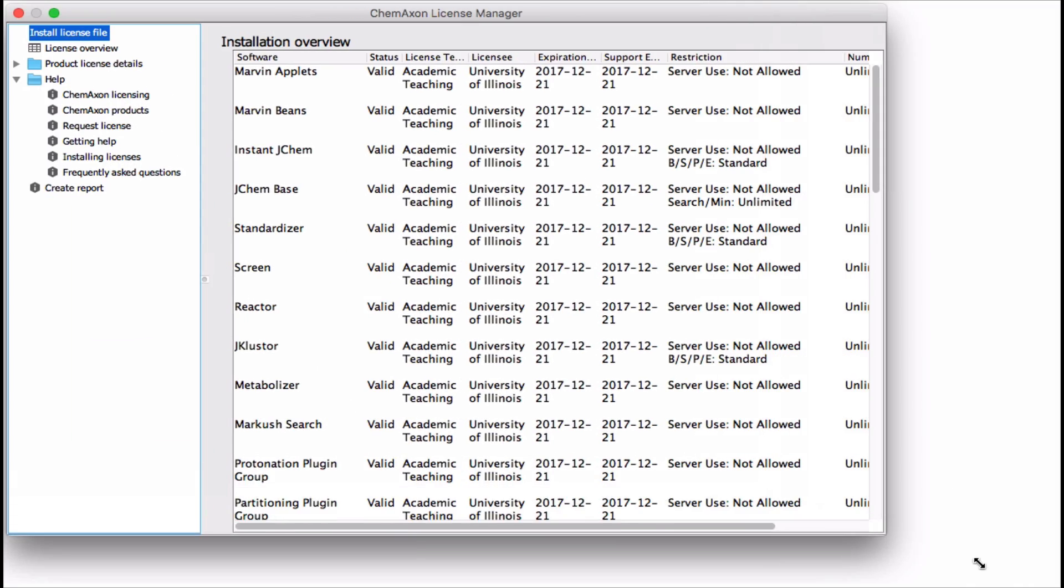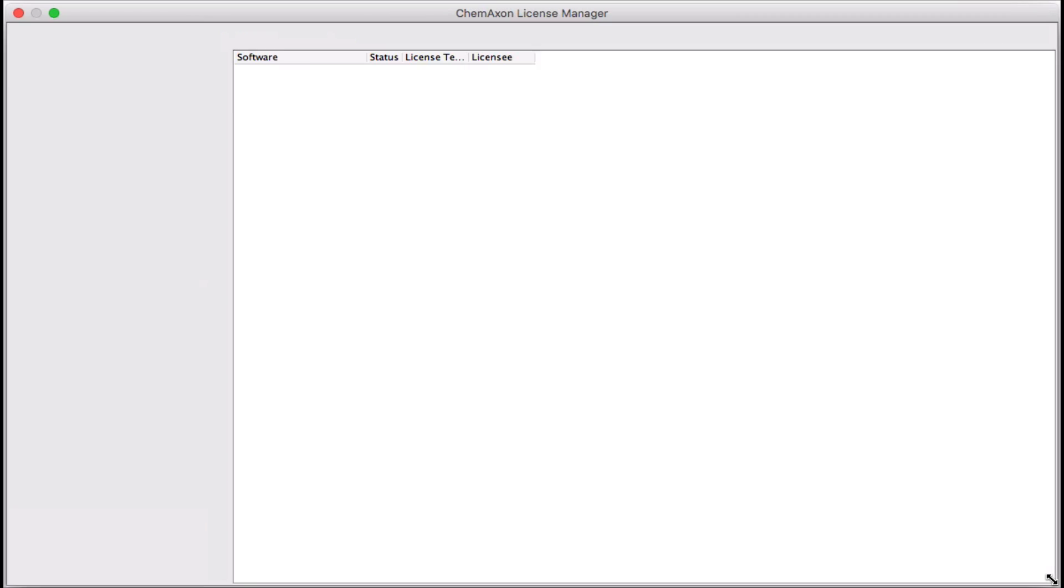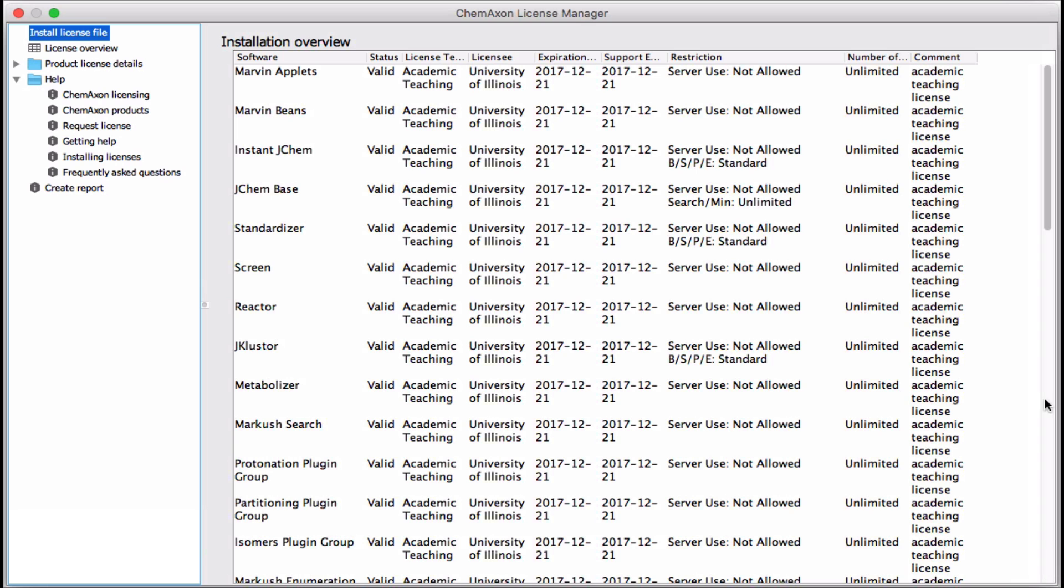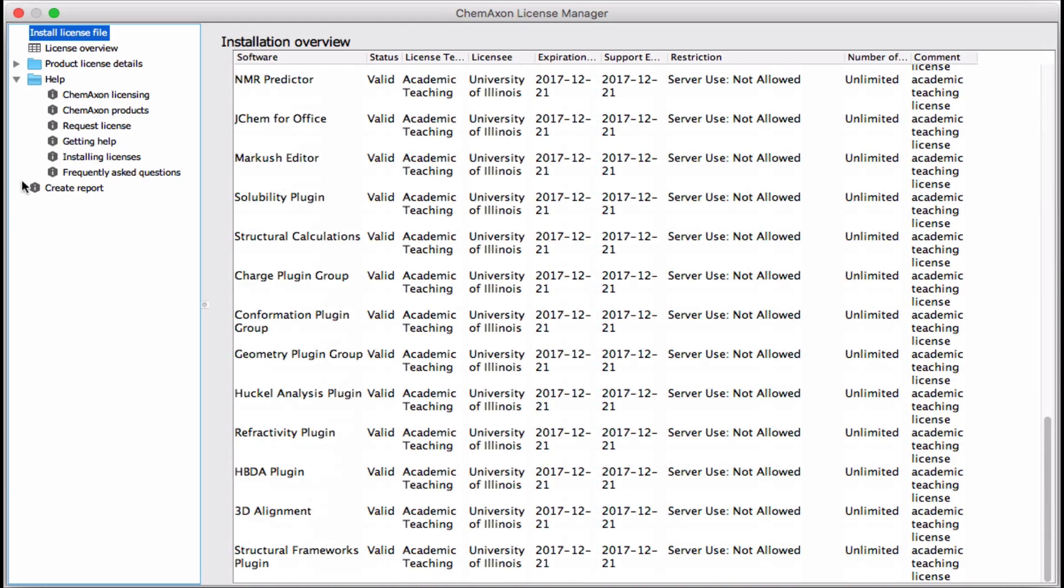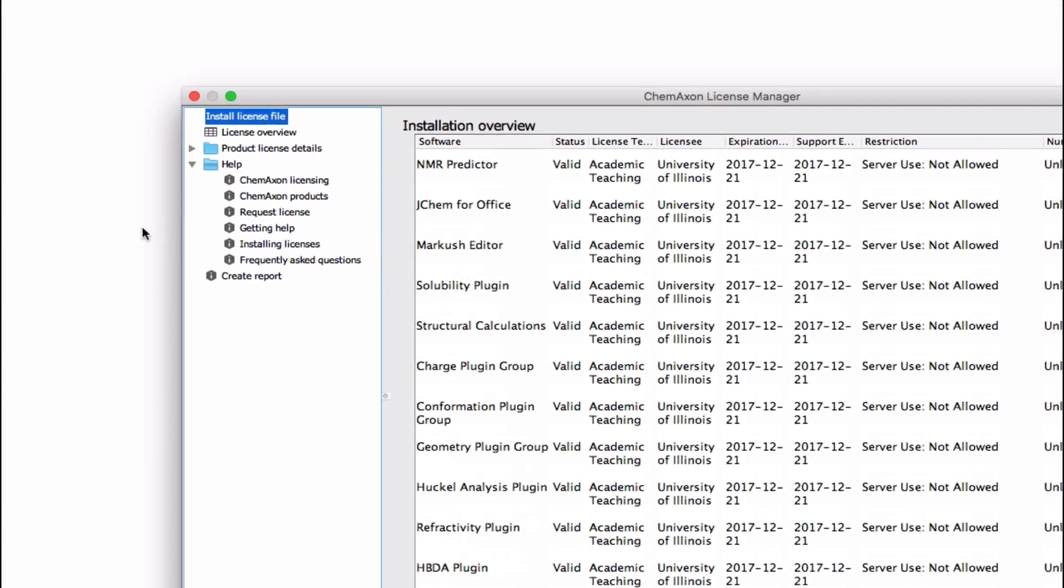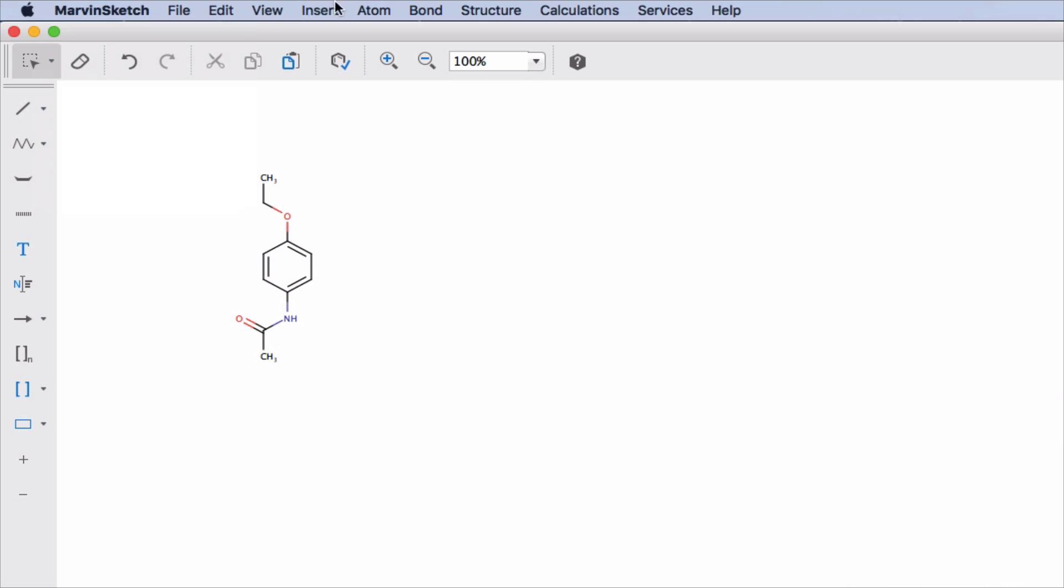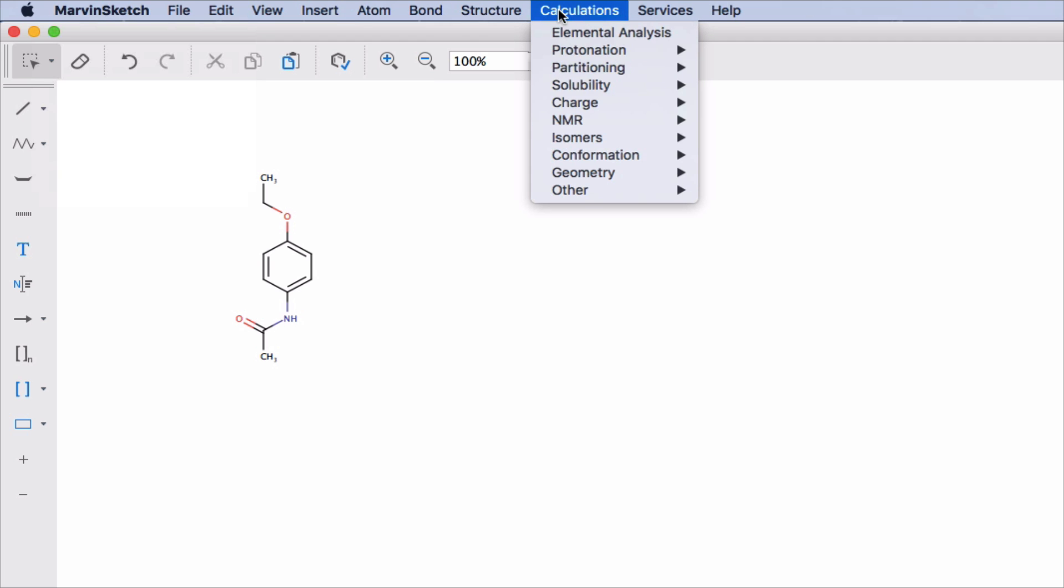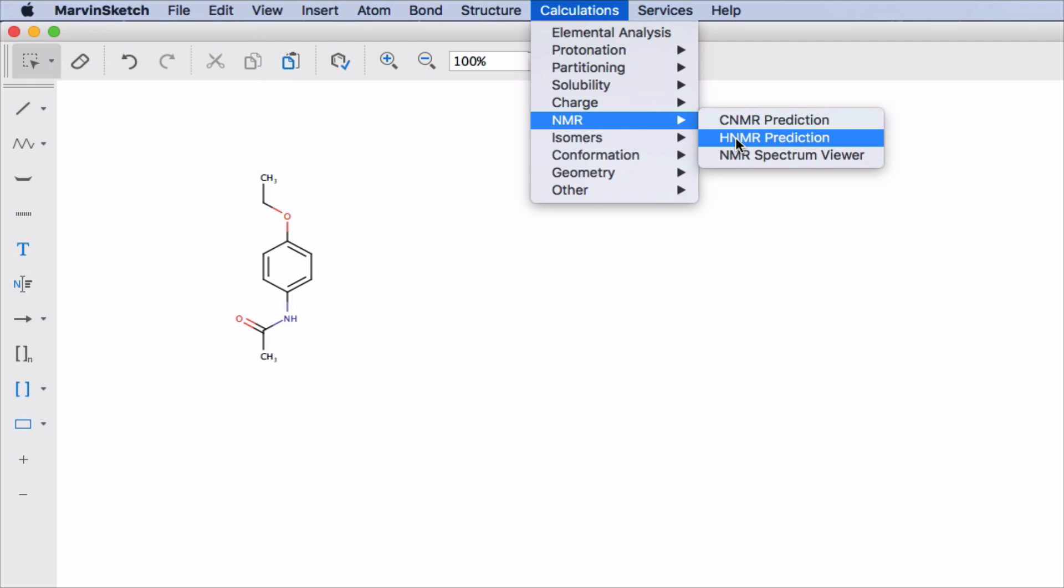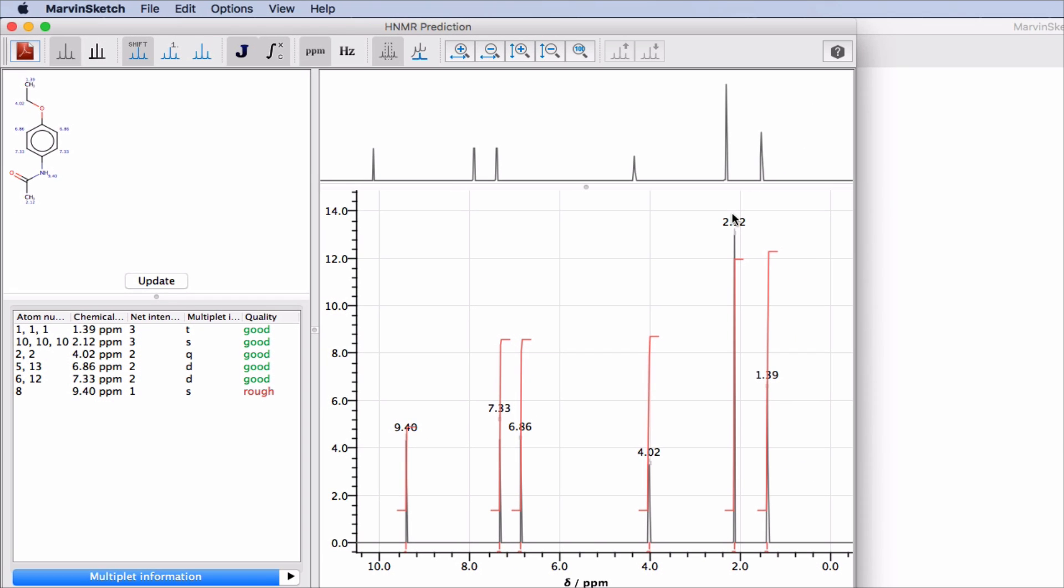This suite of software will bring you unprecedented abilities to solve real world problems in chemistry and life sciences. Let me show you with one quick demo. I'll predict the NMR spectrum of the molecule that's on the drawing canvas.